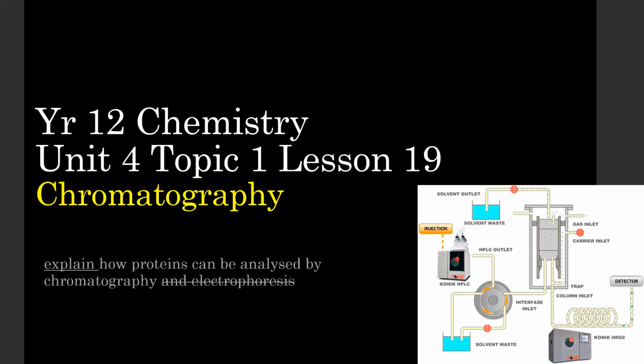We're just looking at how proteins can be analysed by chromatography. Today we'll particularly look at high performance liquid chromatography, and you can see an example of that HPLC setup right here on the front page, and let's get into it.